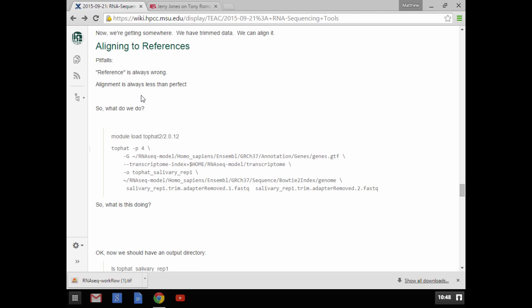It takes a lot of work. It takes taking the reference genome and indexing it for whatever tool you're using. It takes finding a way to search through that information to be able to figure out what the location is. And then on top of it, because we're trying to do transcriptomics, it has to be tolerant to gaps in the alignments, so it has to be able to align part of the read here and part of the read somewhere else and record all that information. If you were doing this to a bacteria with no introns and exons, you would just align it. All you would need would be the directory of the genome, and everything else you could just say, I don't care about it, and I'm going to see what happens.